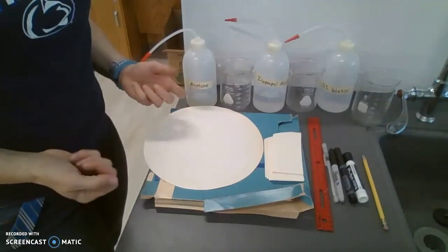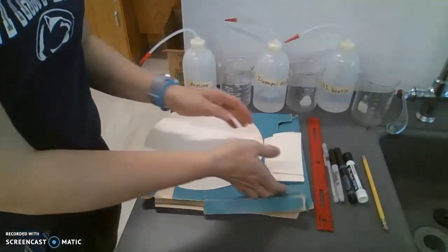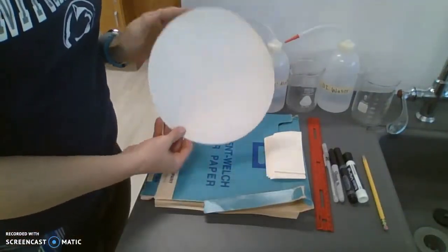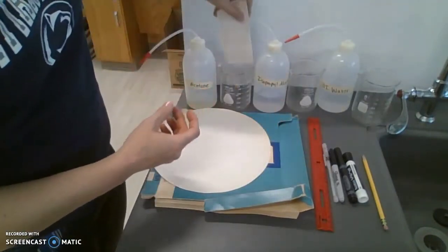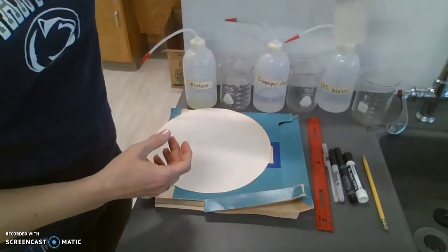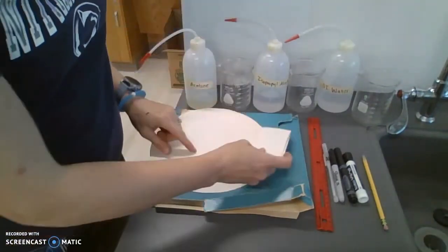Okay, now for our materials. What we need is some filter paper. I took this large piece of circular filter paper and cut it into strips so that it could fit inside our beakers nicely. Okay, so we have filter paper.